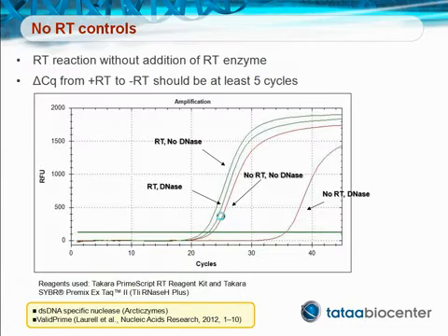However, not all genes have introns. Also, many genes, in humans some 15%, have pseudogenes that often lack the introns of the functional gene. Amplification of those pseudogenes cannot be avoided by primer design. Some genes have hundreds of pseudogenes, leading to substantial background from genomic DNA.